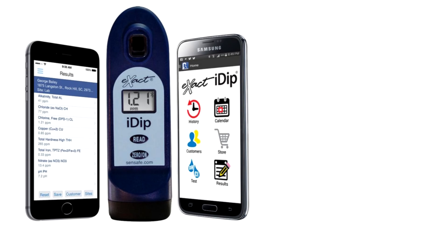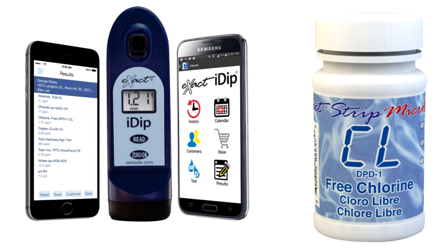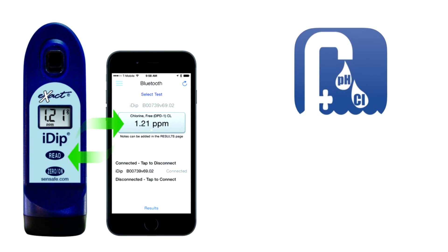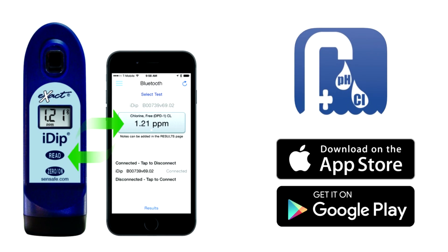The Exact iDip is a photometer that uses unique test strips. These test strips have the reagents on them. When you move the test strip back and forth inside the chamber of the photometer, the reagent is released and the iDip will get an accurate reading of all the pool test factors. You would do all the testing through the Exact iDip app, which is compatible with your Android device or your Apple device.